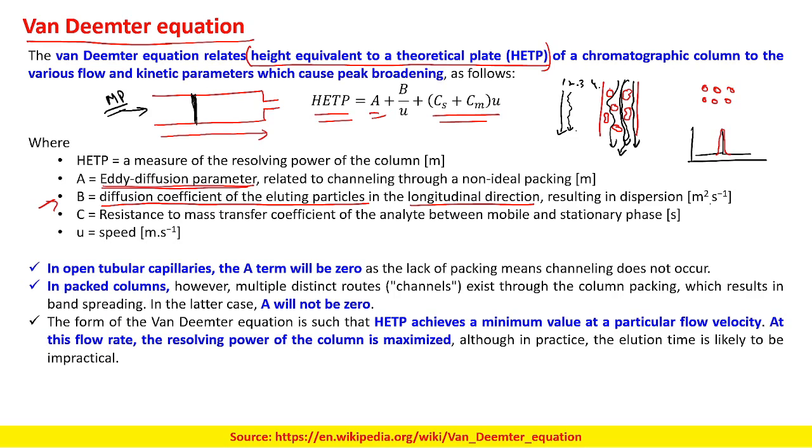Okay, however, when it is getting out there will be a back pressure onto the system also. The solvent or the mobile phase will come out because the inlet pressure of the mobile phase is greater than the back pressure. Okay.